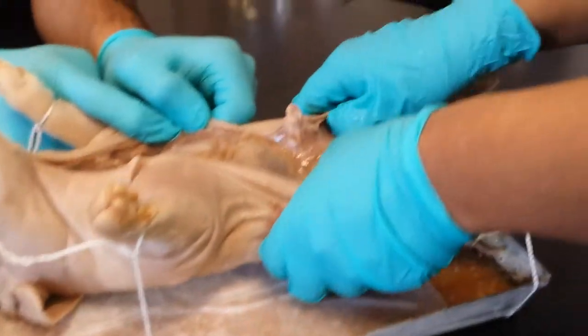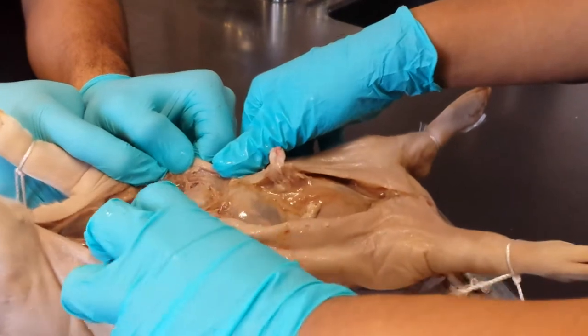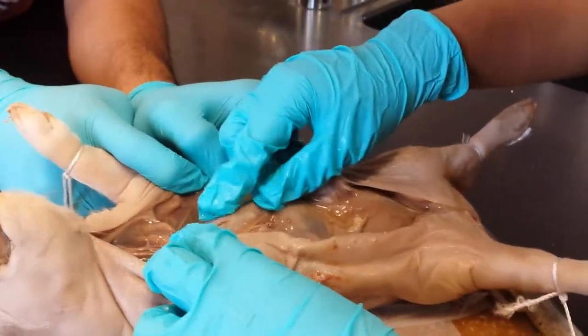Abdominal cavity exposed, observe the peritoneum or cavity lining. Cavity lining, I don't even know what that is. Is it this part that I cut off?